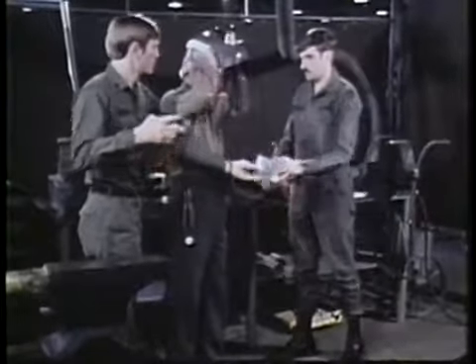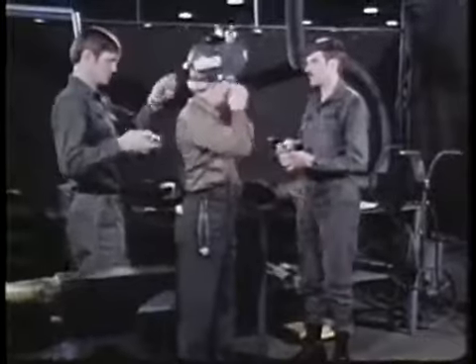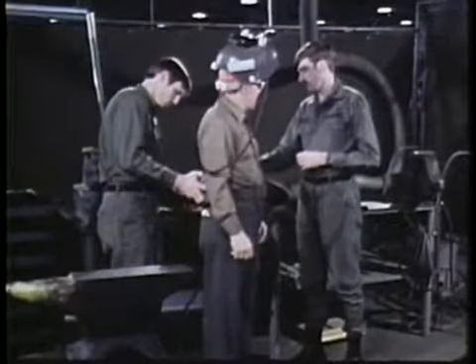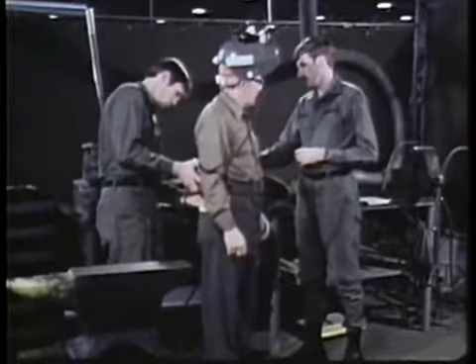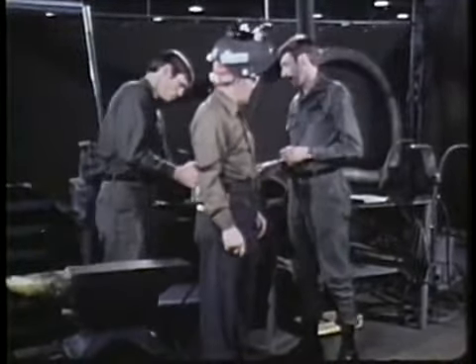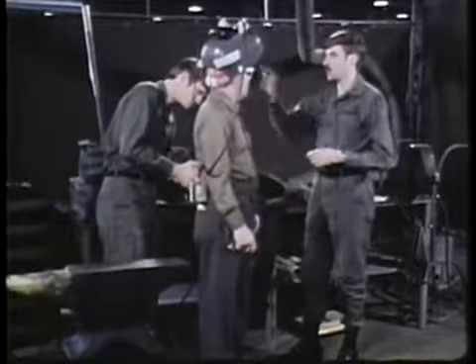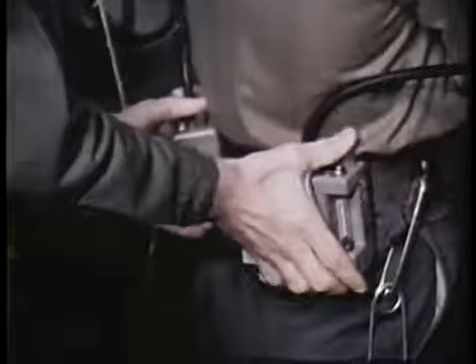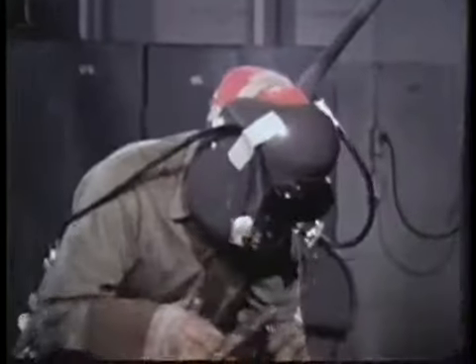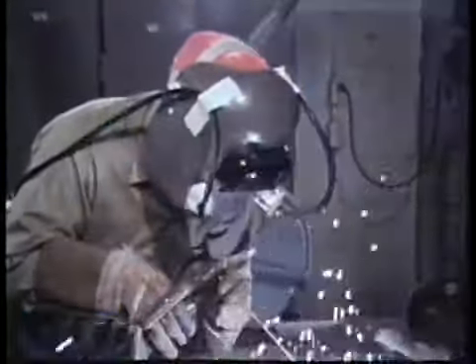The special welding helmet has the filters already mounted in a manner to obtain air samples from within the helmet, the air that the welder is actually breathing. Again, air sampling pumps are used to draw the air through the filters. The Industrial Hygiene Evaluation Guide tells you what type filter to use and how long to sample for the different types of welding fumes.